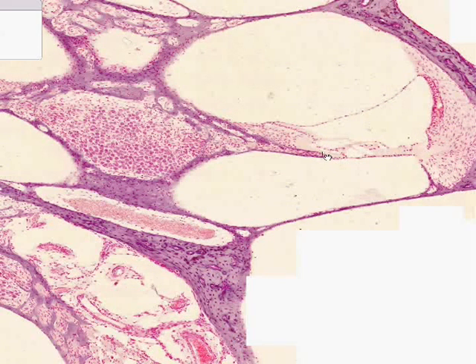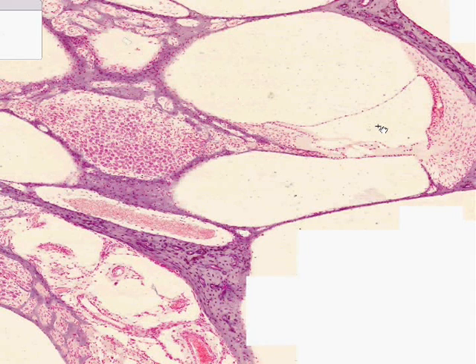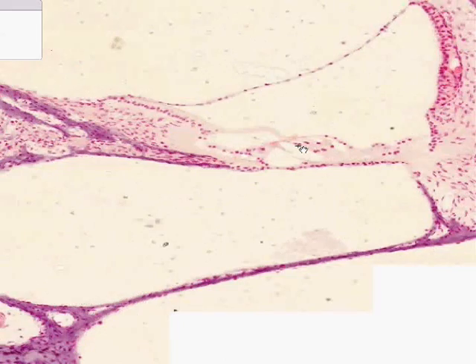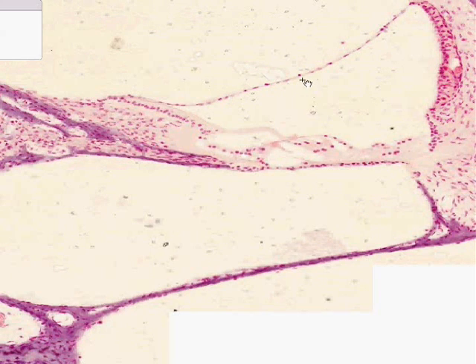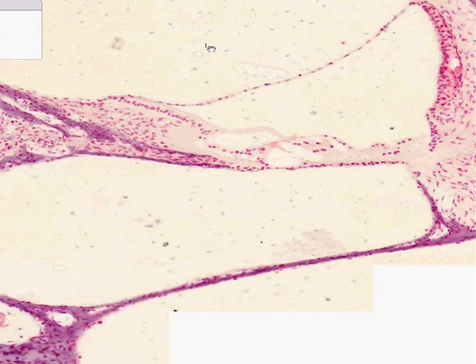Just to make things easy, the one in the middle in which you have the organ of Corti, which is this region here, is called the scala media, filled with endolymph. Whereas the large scala on the other side of the vestibular membrane is called the scala vestibuli, which is filled with perilymph, as is the larger scala on the other side of the basilar membrane, which is the scala tympani.